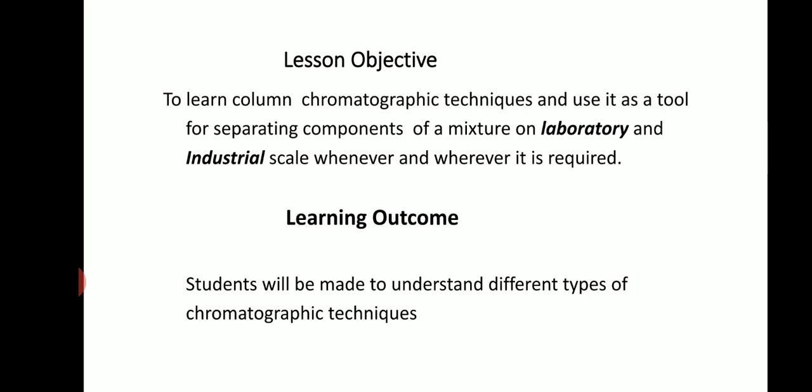Firstly, we go through the lesson objective: to learn column chromatographic technique and use it as a tool for separating components of a mixture on laboratory and industrial scale whenever and wherever it is required. Learning outcome: students will be made to understand different types of chromatographic techniques.